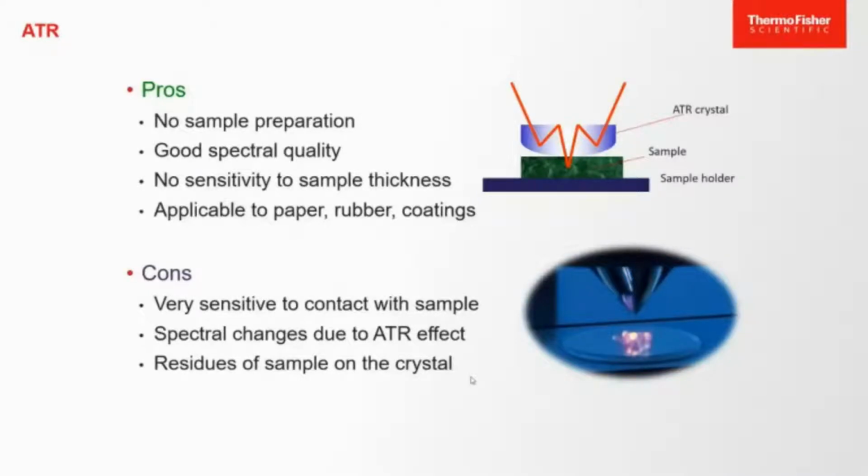So if you're doing a map, you can actually drag part of the sample with you. I once analyzed a sample at a company that makes adhesives, and not only was there residue on the tip, it just picked up the sample and moved it because it stuck to the tip. That's what it's for. It's an adhesive, so it's stuck. And this made the analysis a little more difficult. But there are ways to get around that and to make sure that everything goes all right with the ATR.